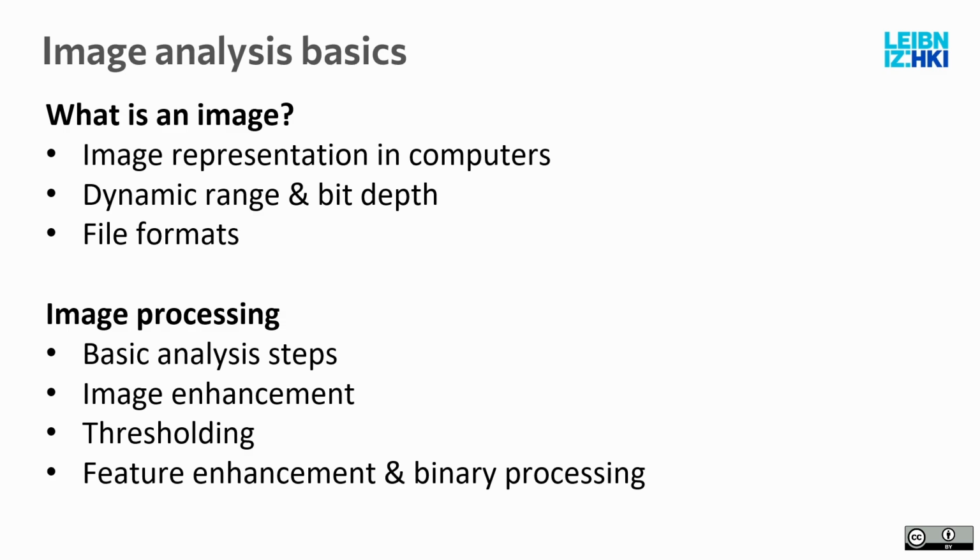And then the steps of how to actually do the image analysis, because these things are all very universal and you can apply them to many different tools. If you, for example, jump later onto Python or whatever new tool is around, these are all based on these things, and you can apply these steps that you have learned here.